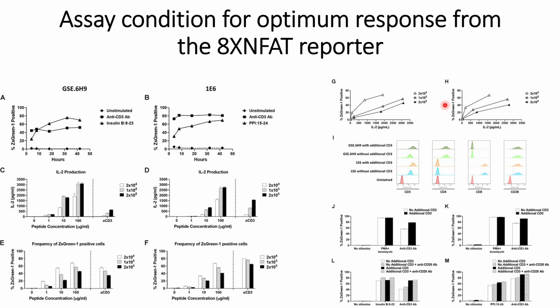Now previously they have shown that if the CD3 genes are present in the T cells, then it will stimulate much faster. So they transduced CD3 genes into the T cells, and then checked the expression of those CD3 genes, and we can see that the CD3 genes are expressed, although they are already expressed in these T cells, and we can see that levels do not change significantly.